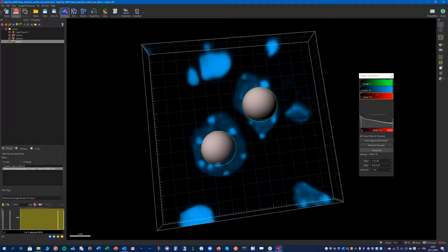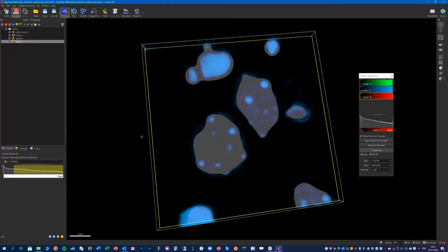We can see here by playing with this value, with this threshold, that you can restrict the detection to those 2 points. And now we will proceed here to the next step, which is a real intensity threshold to really describe correctly the shape of those nuclei.